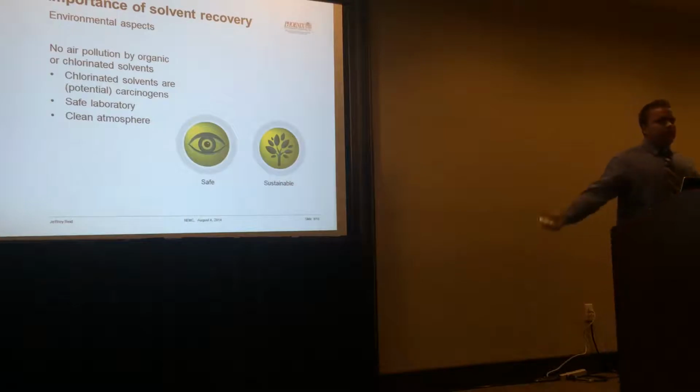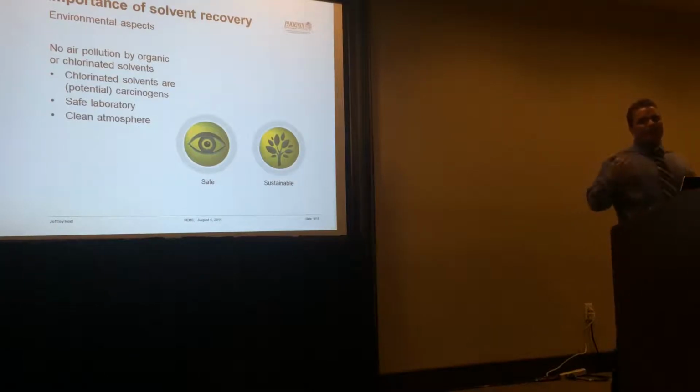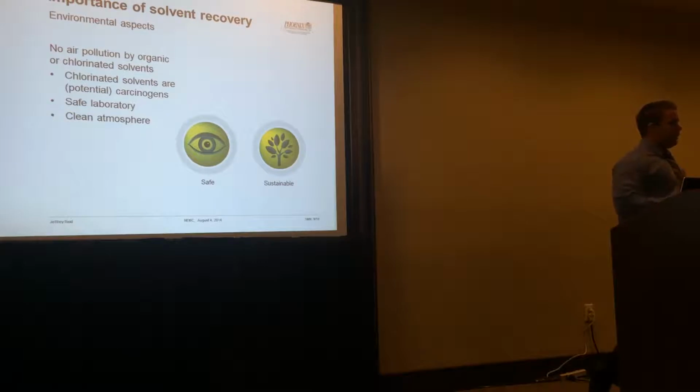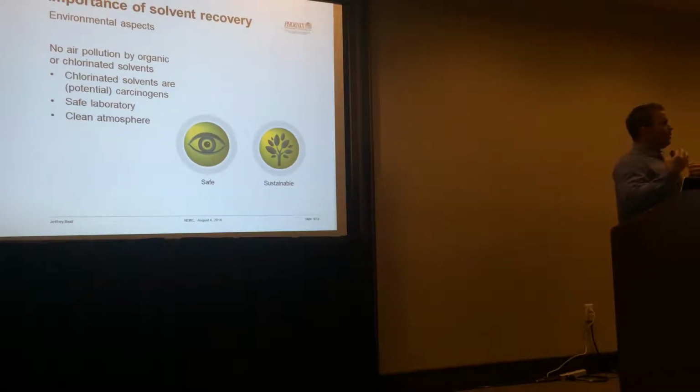Two, what is everybody using? Everybody's using dichloromethane. Dichloromethane is a chlorinated solvent. That means it's a carcinogen. It's not fair for users to actually breathe this solvent in. It's not healthy. It's dangerous. So there's another reason. You've got to have that safe atmosphere inside your laboratory.